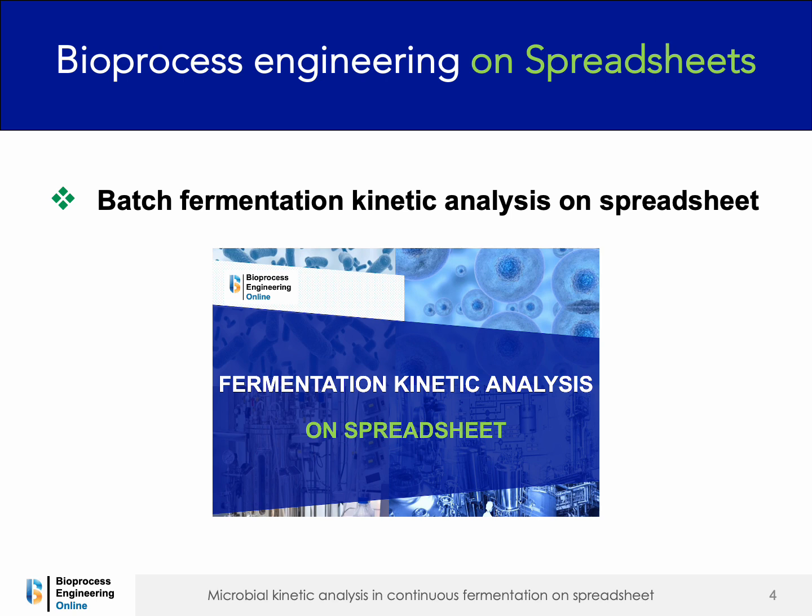Microbial kinetics are conventionally determined through batch fermentation experiments. In a previous tutorial, we described the determination and analysis of microbial growth rates in batch fermentation using a spreadsheet-based approach.